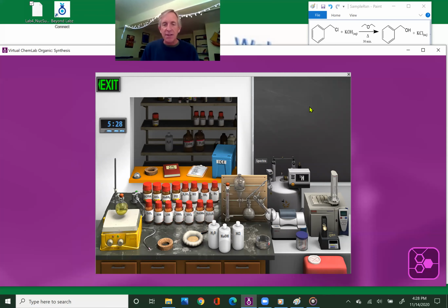I have to add all these other reagents, but the stockroom is closed. My diethyl ether is in there. What am I going to do? Oh, no. Okay, so the best part about this, anytime you make a mistake, like I've done for weeks in a row now, is that it's very easy to start fresh. So I'd like you to start fresh.